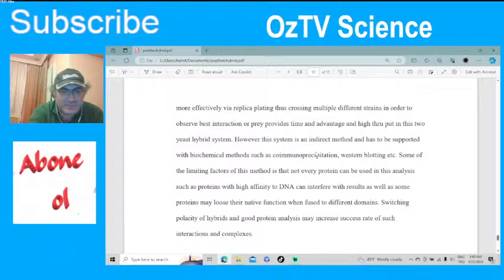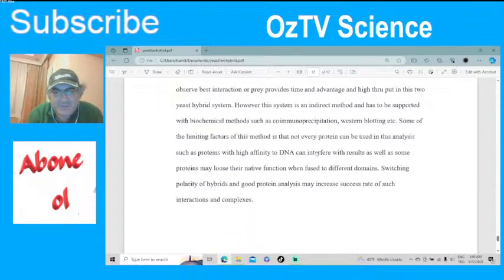And it says some of the limiting factors of this method is not every protein can be used in this analysis, such as proteins with high affinity to DNA. If the protein itself is directly binding to DNA, what's the use of it? Because it can change the outcome.